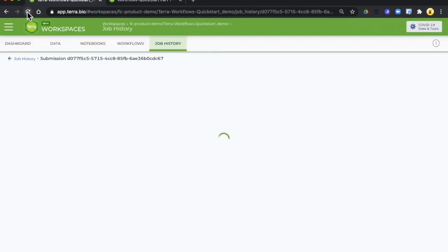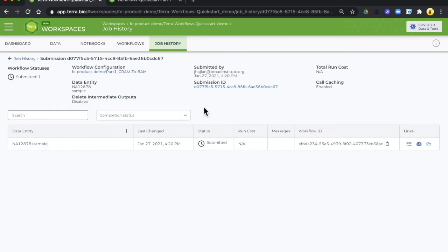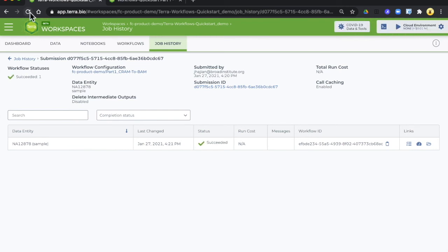Now the status is submitted which means that everything is set up and it's waiting for the virtual machine. When you refresh it and it's done you will see under status a nice green check mark and succeeded. Congratulations for running your first workflow.